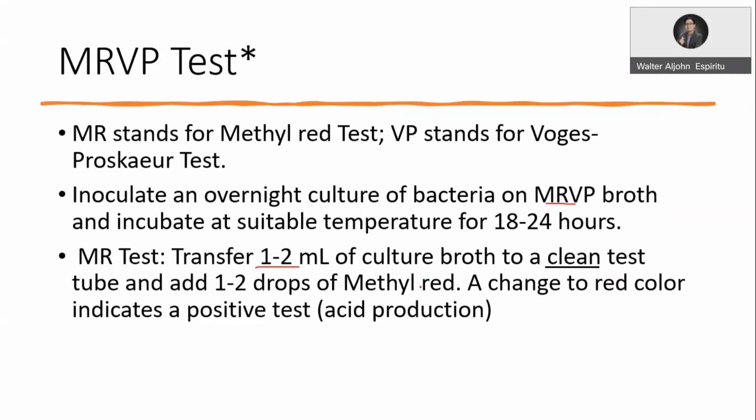Transfer it to a clean test tube and add 1 to 2 drops of the methyl red indicator. If the indicator stays a red color, it means that there is acid production, and indicates a positive result for the methyl red.